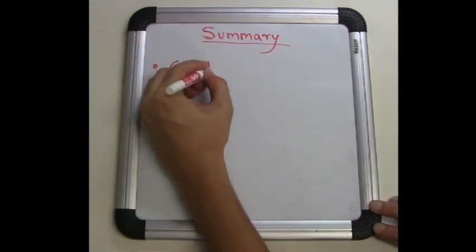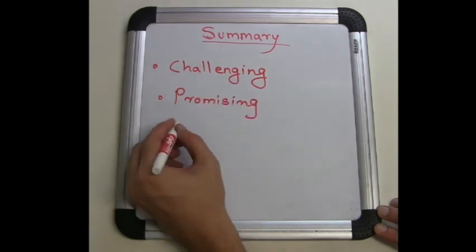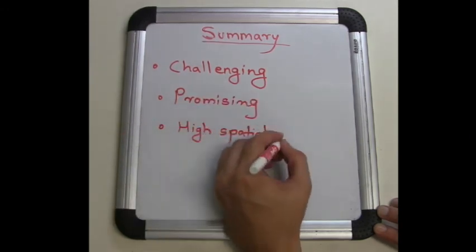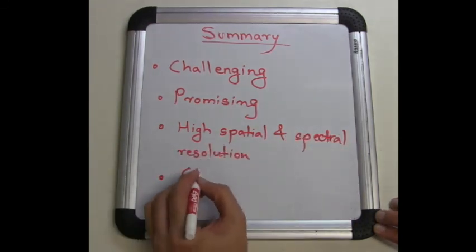In conclusion, tip-enhanced Raman spectroscopy is a challenging and promising technique to enable true high spatial and spectral resolution at the nanoscale, capable of achieving the holy grail of single molecule detection.